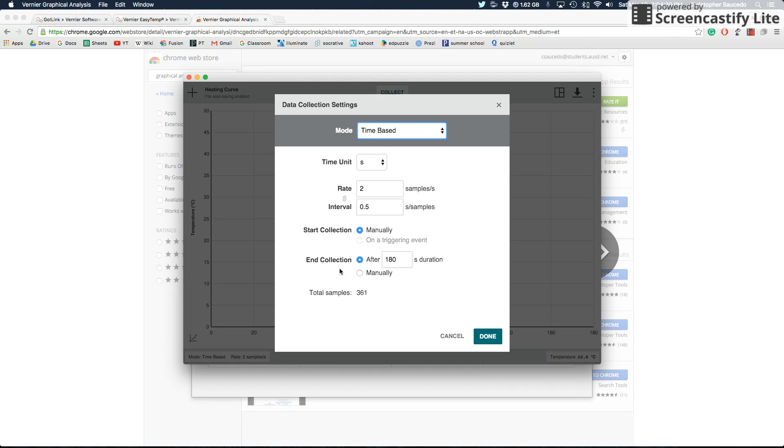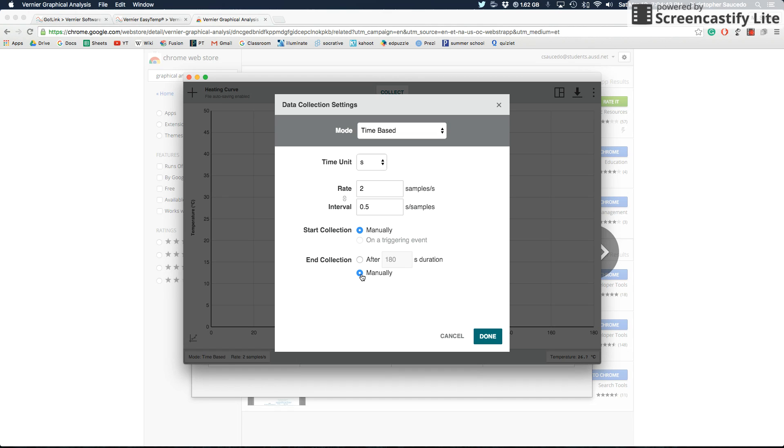Right here is a big thing that you're probably always going to want to select. It says end collection after 180 seconds. If you want to have longer than 180 seconds for your data collection, you're going to want to hit manually instead so that it'll do it forever. As long as you are collecting data, it'll keep doing it until you specifically tell it to stop. I'm just going to click done.